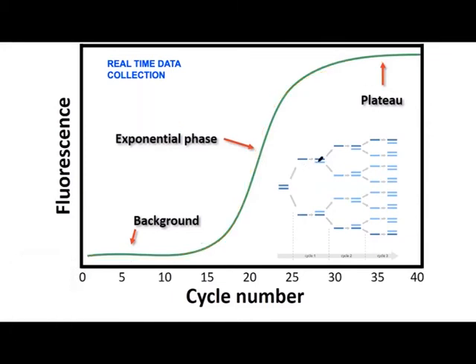Actually, to repeat, it's a molecule that, during the PCR, whenever you form a double strand molecule, will intercalate between the two strands here and here. And every cycle, you're going to get more fluorescence because you're going to get more PCR products. And again, this SYBR Green is not specific for a specific sequence. It only binds randomly to any double strand DNA that's being formed.